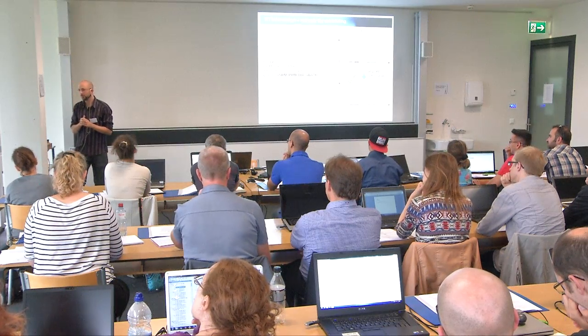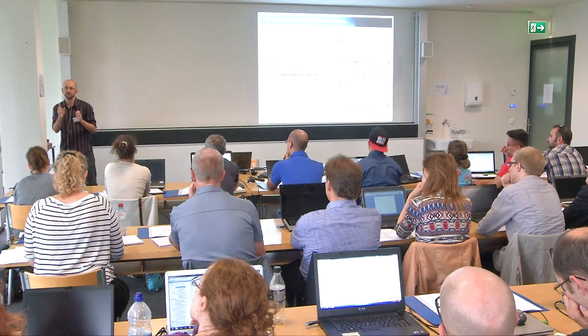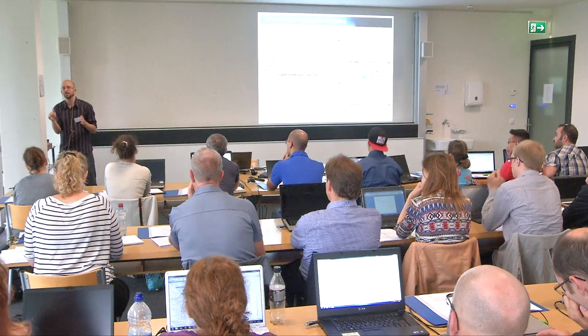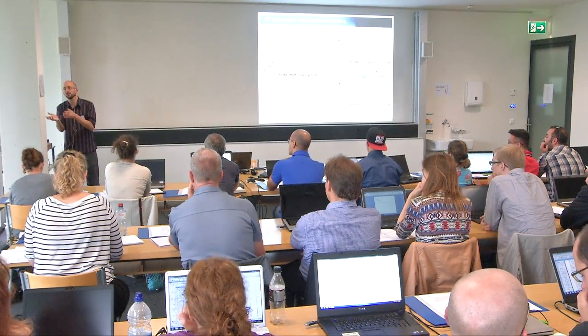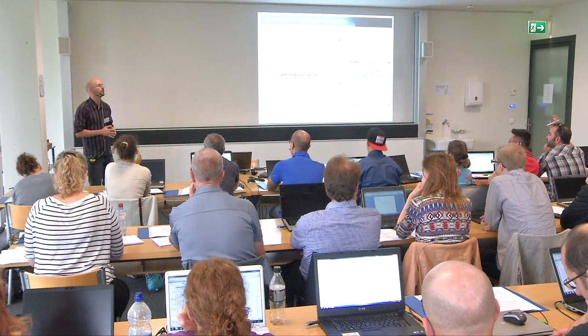It will not tell you, as you explain now in Pinpoint, what's going to be the final cycle time, but you can estimate it. In other machines you set the cycle time as a forced parameter, and then you basically don't have this option as you described. Any other question?